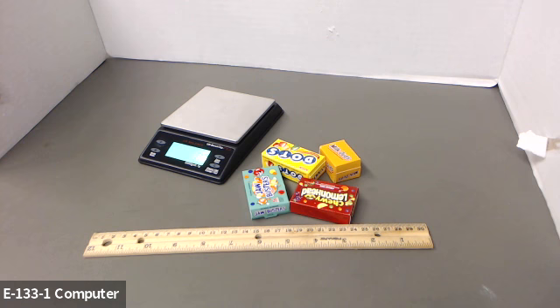I'm going to go through the process with you and tell you what you're going to be doing. You're going to need to know the mass of the full box and the empty box, and then you'll also be doing some other measurements.